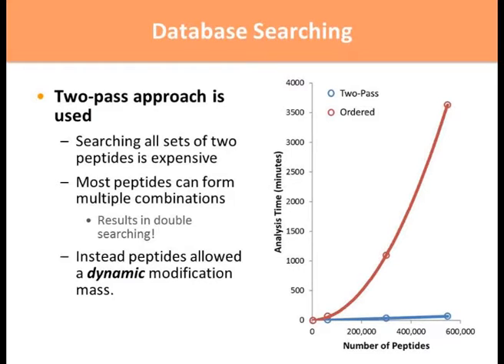I gave you some of the complexity before in search space with regular search engines, and that choosing an unconstrained search or choosing a lot of differential modifications creates this enormous search space that can slow down your analysis to a point where it becomes significant in that you cannot complete an analysis.